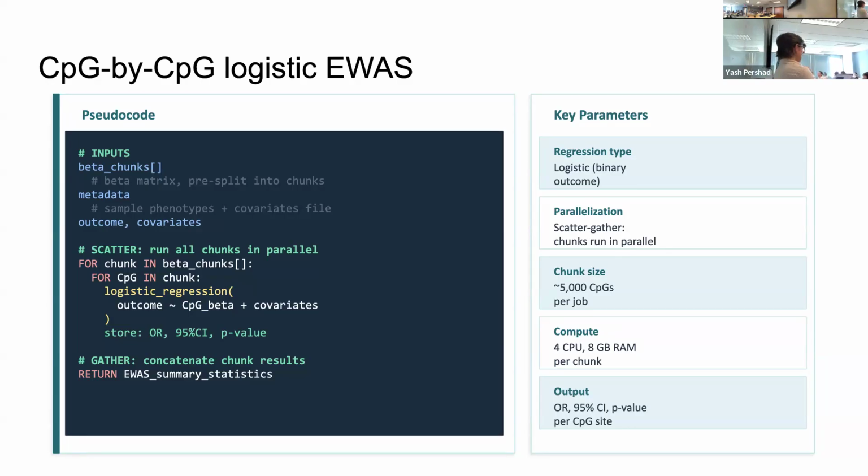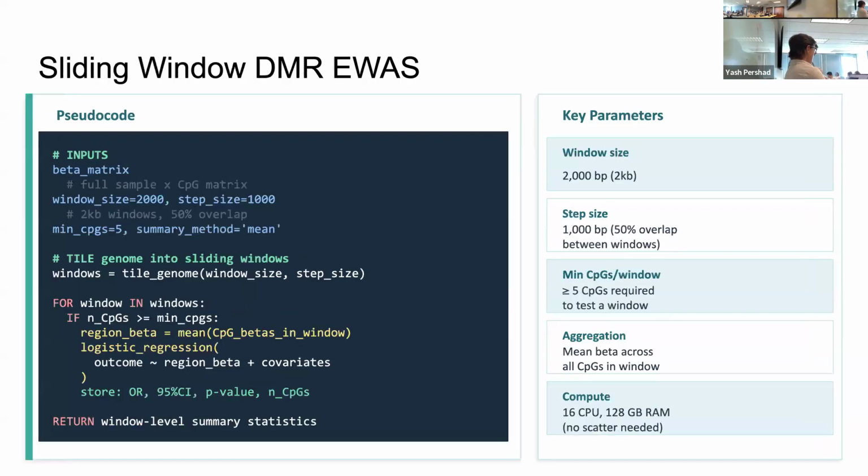For loop across all of the CpGs. And we talked about the output.